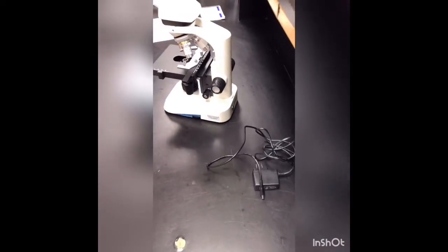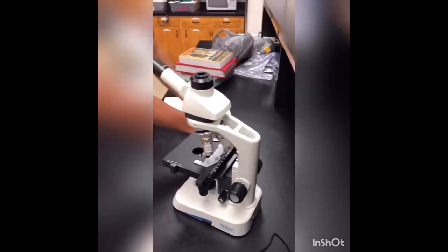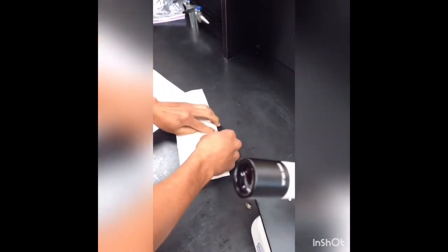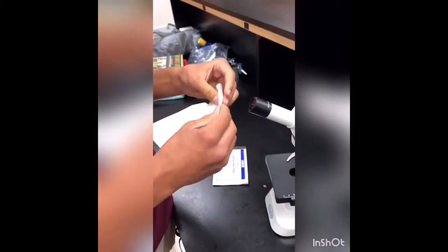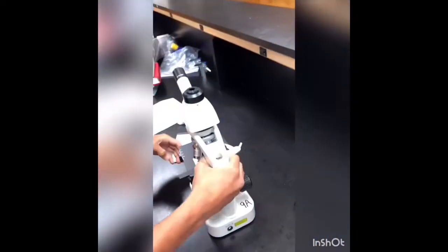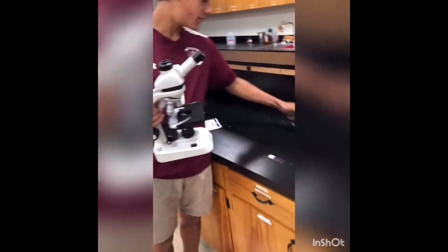And then you need to take an optical lens wipe from this little holder and then you want to wipe off the lens right here. Make sure you didn't get anything on it. And then you need to take the microscope from the back, put your hand on the bottom, and then you'll want to put it back in the case and put this back up too.